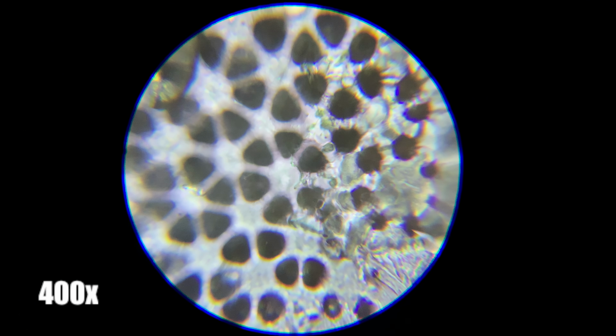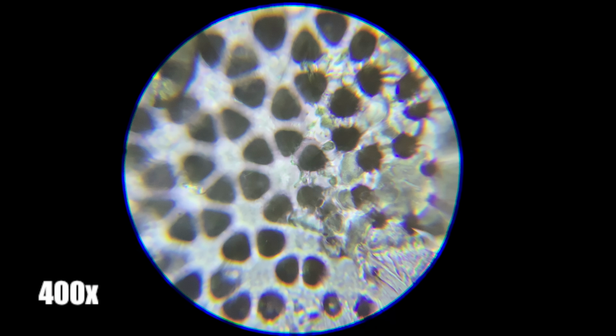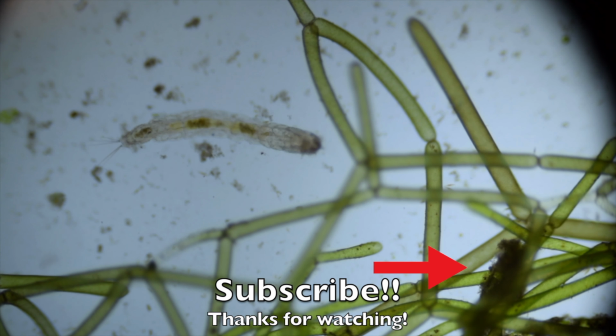I would like to add that these insects are invasive and harmful to many crops and wildlife in my area, which is one reason that I collected one of the eggs for this video.